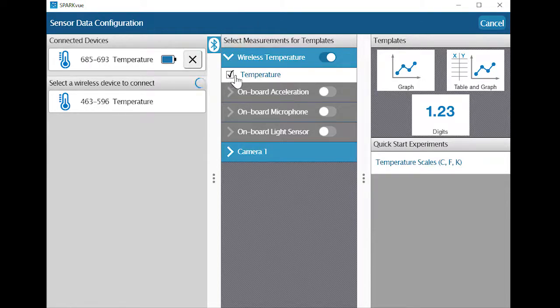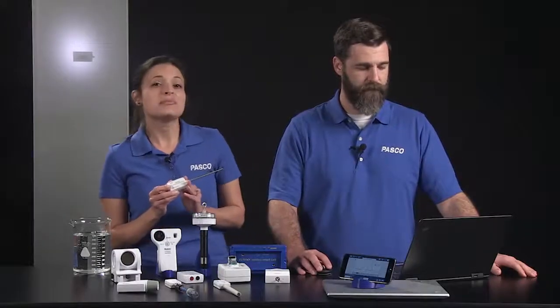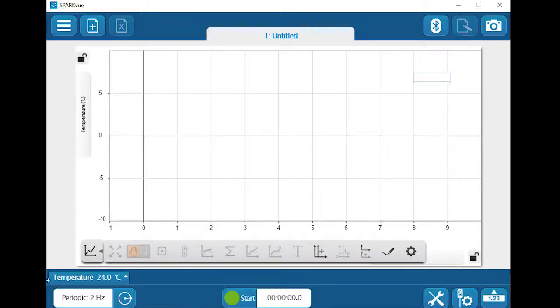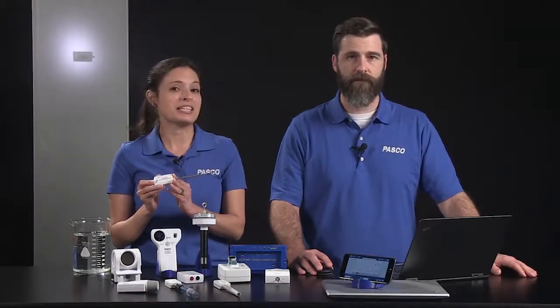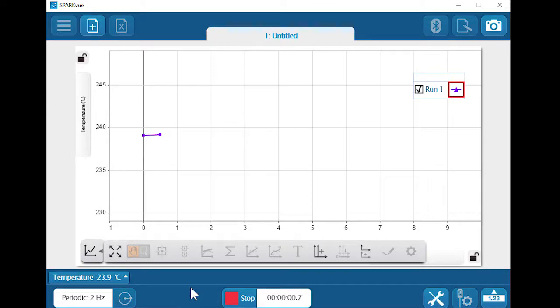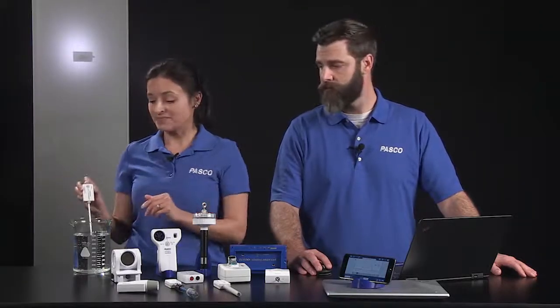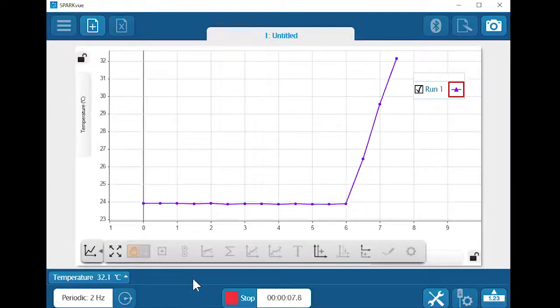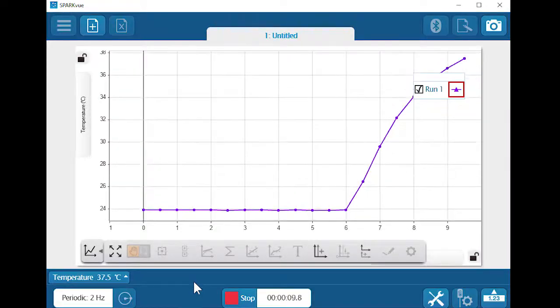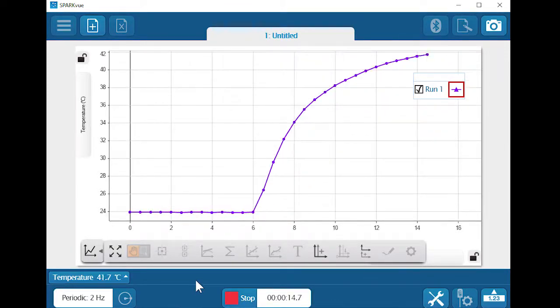Let's display our sensor's temperature measurement in a graph. I don't see any data in the graph yet, but I can see a live data preview in the bottom left corner of SparkView, so I have an idea of the current sensor reading before I start recording data. Let's start recording — there's the air temperature. Now let's measure the temperature of the warm water in this beaker. You can see how fast the sensor responds to the new temperature, and notice how the graph automatically scales to fit the data as it is collected.